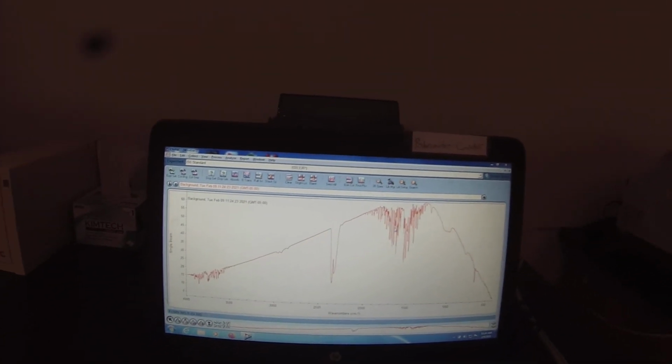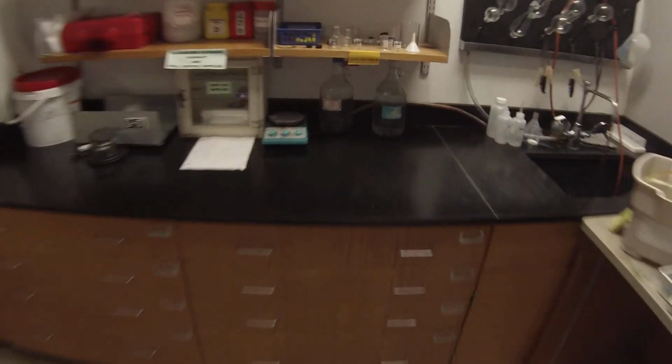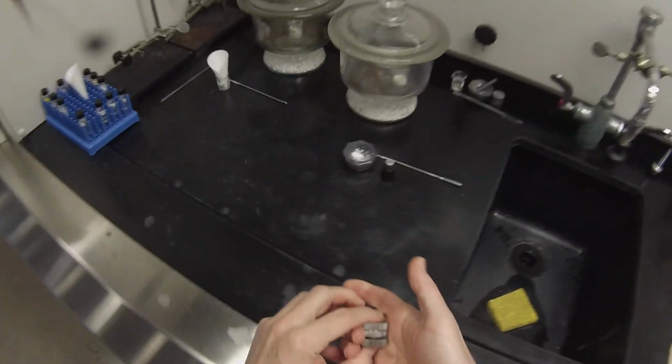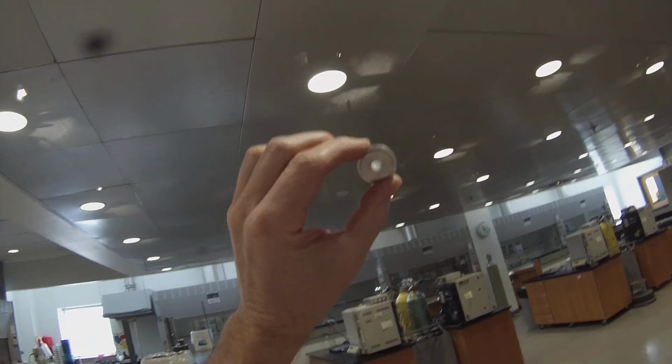And it does. Got water and CO2 in there as normal. So we don't need to save that. So we have a background ready. Just open this guy up. Pull that top one out and see if we got a decent pellet, and it's quite transparent.